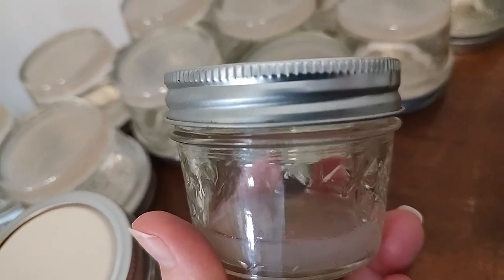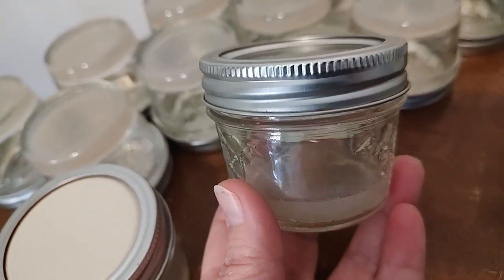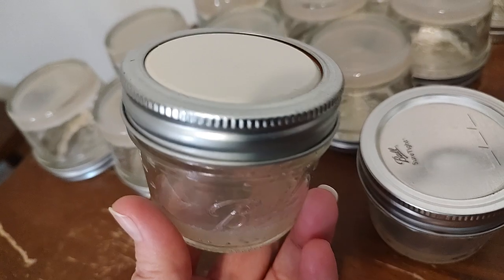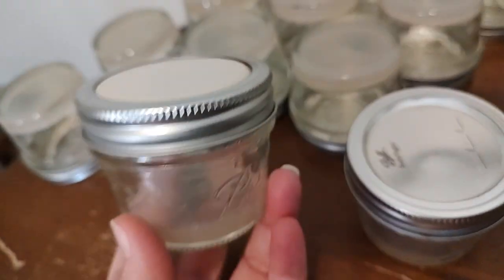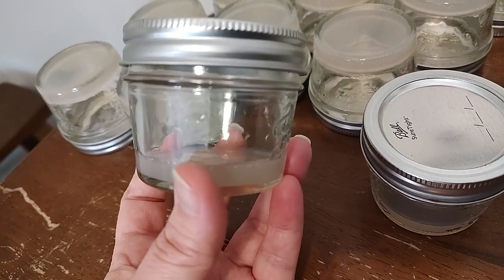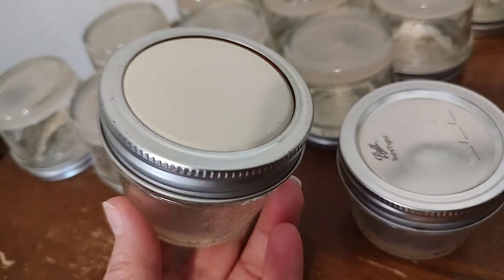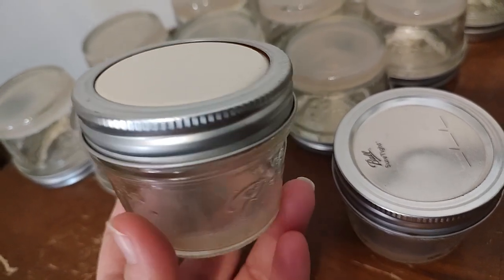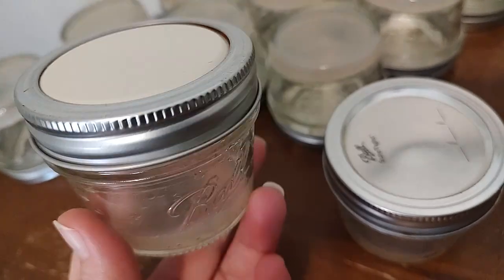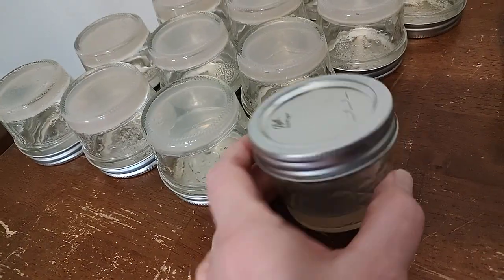We actually did an experiment. I believe it was 24 no-pour jars — 12 with unflipped lids and 12 with flipped lids — and it was a drastic difference. The ones with flipped lids and ventilation had way less moisture, which was amazing. We used to flip them at the beginning, then forgot and stopped. Somebody asked in the comments, so we went back and did that experiment, and I'm so glad because we have way less moisture when we flip the lids.